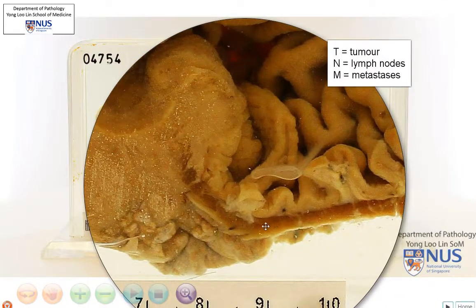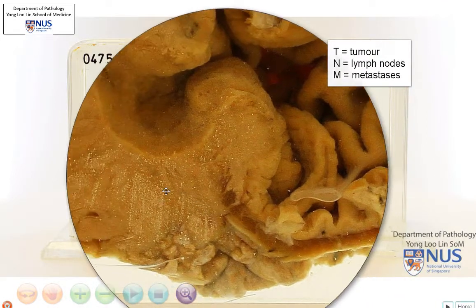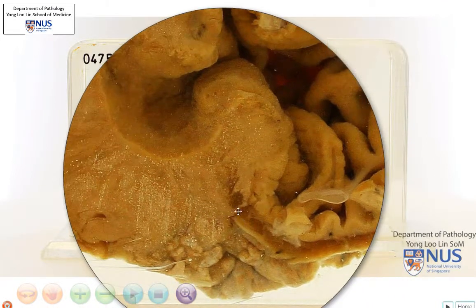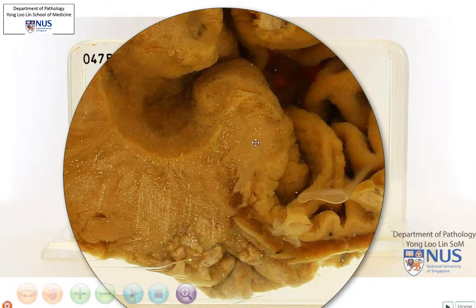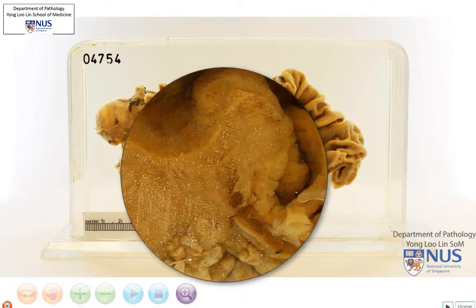If we follow the muscularis propria towards the abnormality, we can see that it disappears here, and this is an ominous sign. It suggests that this mass is invading through the muscularis propria.